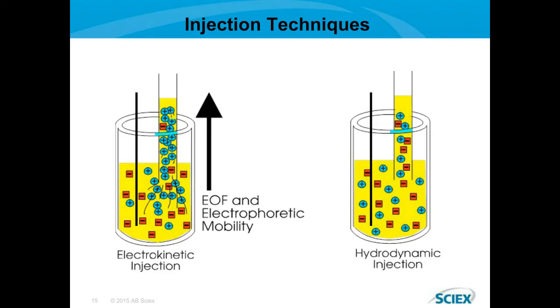And this has a number of effects. It is really a built-in pre-concentration effect. And also what it does is it discriminates between which ions you want to get onto the capillary. So for example, if you want cations to get on, you would have the mass spec as essentially your negative electrode on the other end. And this is important, especially if one has very dirty samples, so that you can leave behind acidic material and neutral material and only migrate cations of interest such as nitrogenous bases which have been protonated.